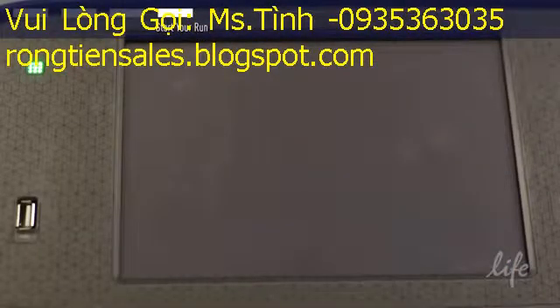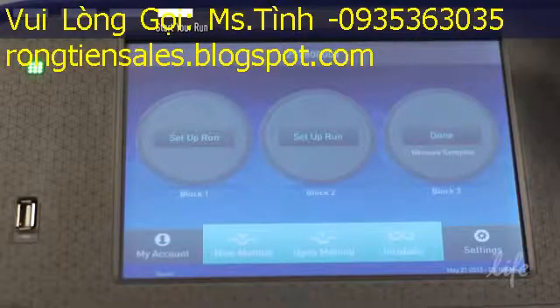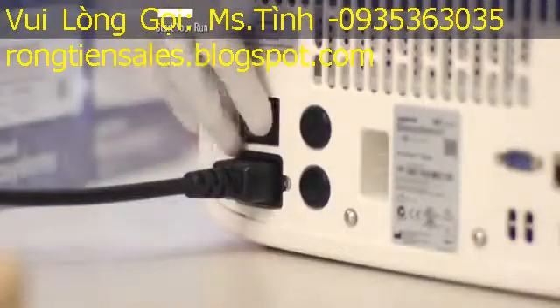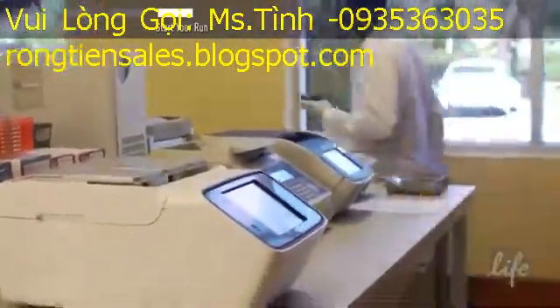If the instrument is inactive for a set period of time, it will go into sleep mode. It can easily be activated again by pressing the screen. The instrument uses minimal power during this mode. However, you can also shut down the unit with the switch on the back. Make certain to shut down your block and turn off the ProFlex PCR system when not in use.